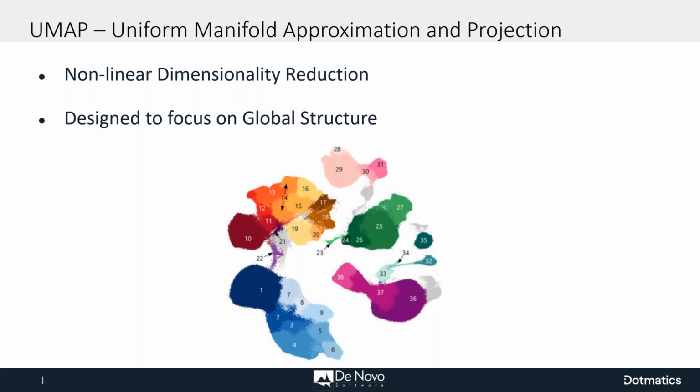We're going to be talking today about UMAP and FlowSOM. UMAP is a dimensionality reduction algorithm. It's one of the more common ones. Another very common dimensionality reduction algorithm is tSNE, and there are many versions, especially if you've been in the field for a little bit. I'm sure you've heard about them. The one I recommend if you're just getting started in this space, if you're interested in trying these things out, is opt-SNE, because it's a little bit simpler to set up. But we're going to be focusing on UMAP today, and then FlowSOM.